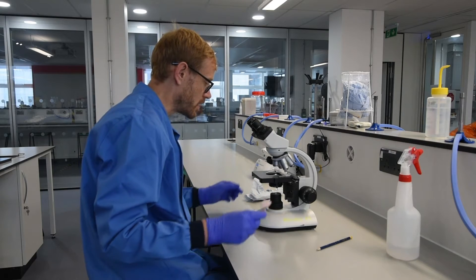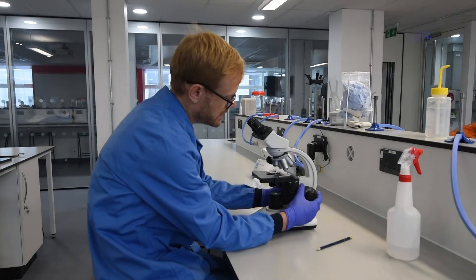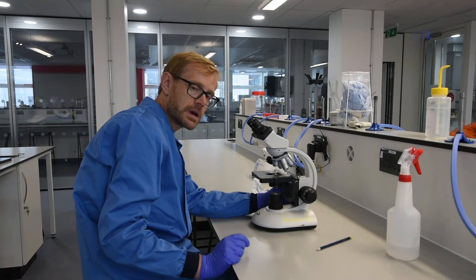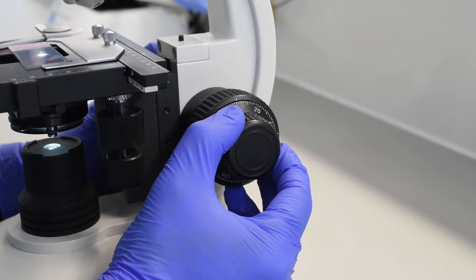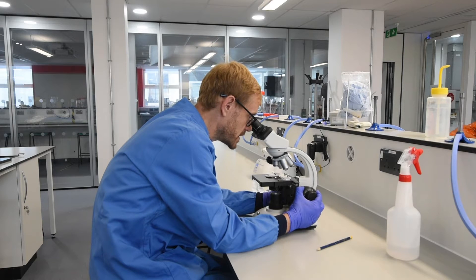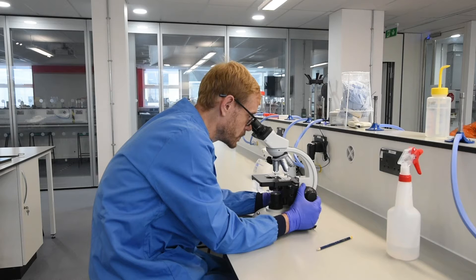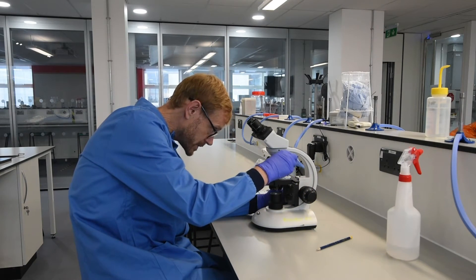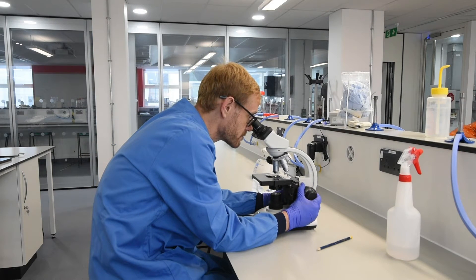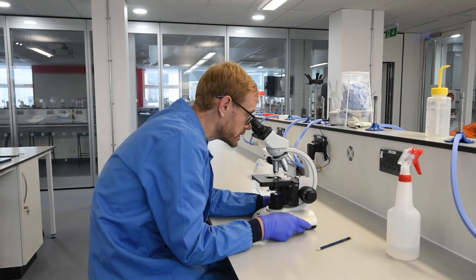We then need to put our slide onto the stage, making certain it's right at the back and that the stage is as close to the four-times objective as possible. We're then going to focus by moving the coarse focus knob towards us until we can see the preparation. We then move up to the x10 objective and again use the coarse focusing knob until you can see the preparation. Finally, we go up to the x40 objective and focus on the cells. You may need to increase the light intensity using the rheostat on the right-hand side.